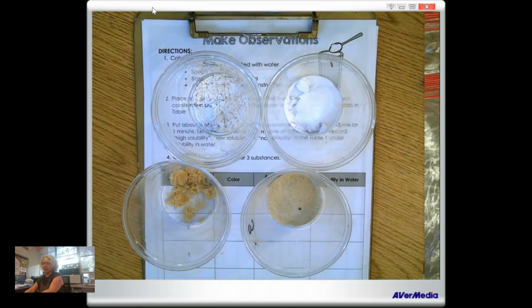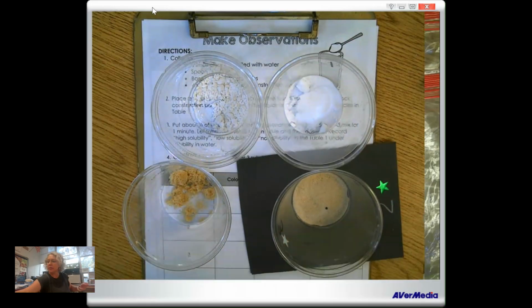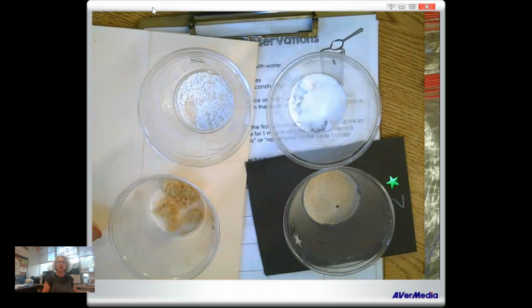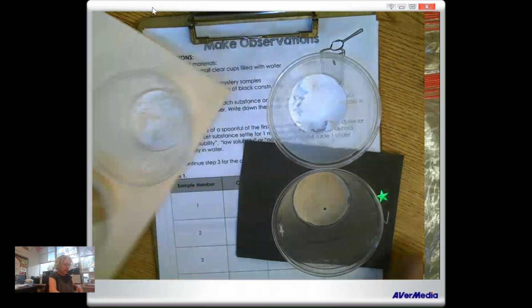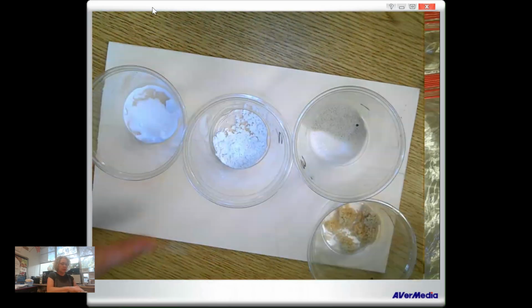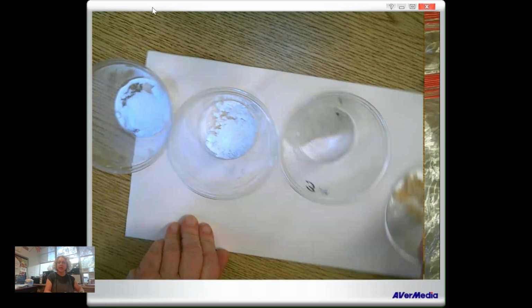All right, so I wonder which would look better. Does that look better under black or under this color? Which shows the color better? I think that'll be fine for now. All right, so I'm going to put these in order. 1, 2, 3, and 4.